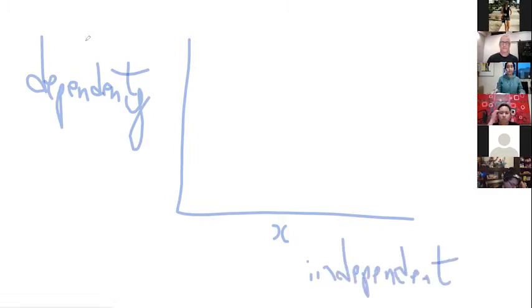Like whether it's water and stuff, or no? The volume? Okay, so we put the volume here in mL. And what goes in the dependent? The mass of the solution. Mass, that's right.